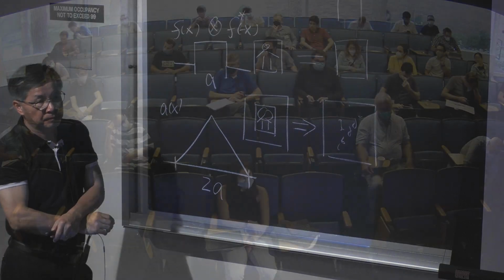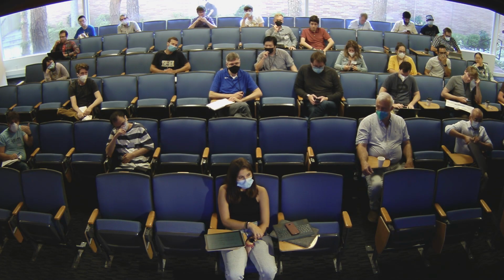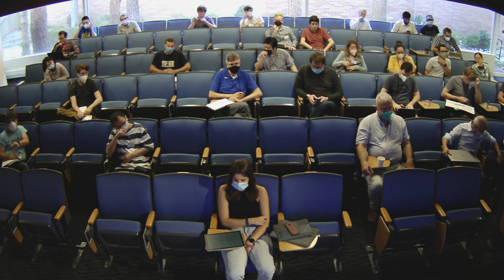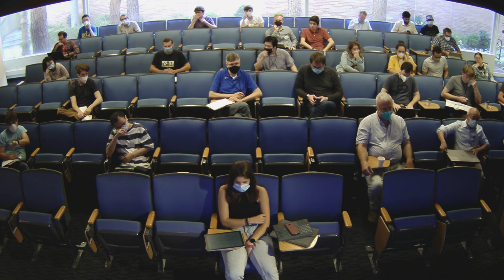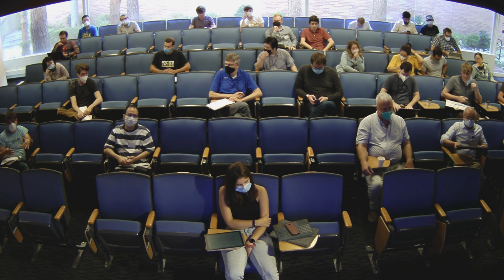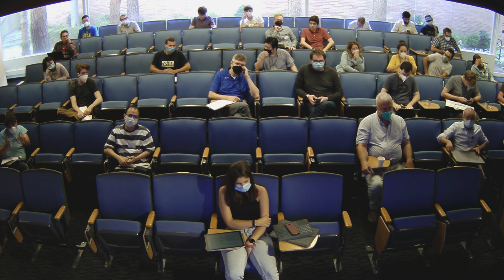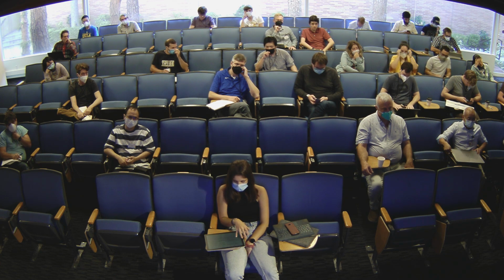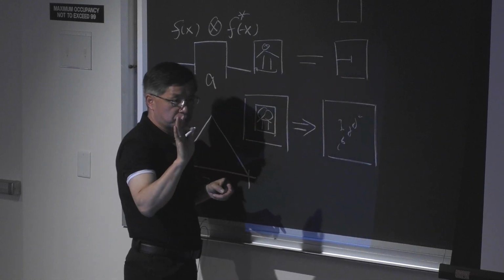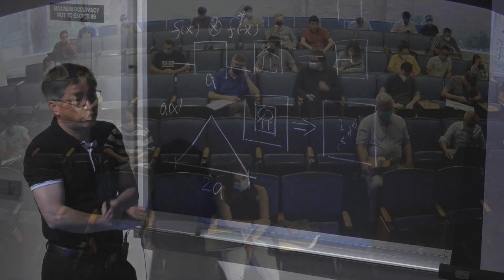So when you say that the middle picture is equal to the diffraction pattern, there you are assuming that you're representing this with just the fast Fourier transform information. Yes. That is, there is some aliasing going on automatically, right? Because you've cut off all the higher frequencies, so you've fixed the resolution at that point. Well, the frequency here, the 1 pixel, exactly corresponds to the frequency here. So this is actually no frequency loss. Exactly. But that's the point. You have fixed the resolution at that moment. Yes, you already digitized.